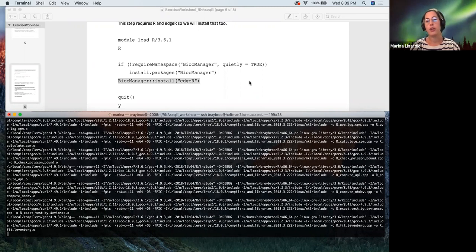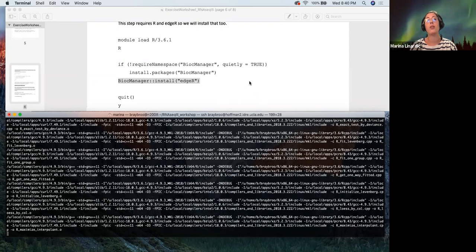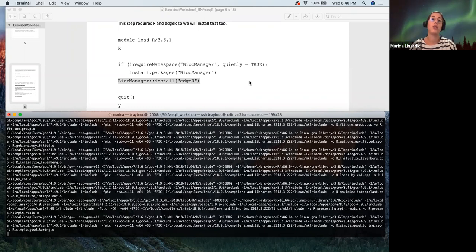I think in terms of differential expression in general, it's useful to run a few different methods to be able to compare them as well, because although they are meant to perform the same, and should give the same results, they're not really always the same. They're similar but not the same. Some are more stringent, some are broader. So it's really good, in my personal opinion, to run a few different ones, and then you can conclude which one works best for your type of data and your kind of biological question, because you should have a biological question preceding running an RNA-seq experiment like this.